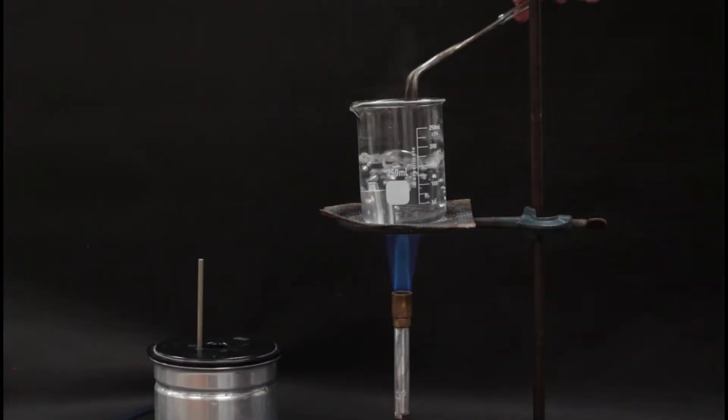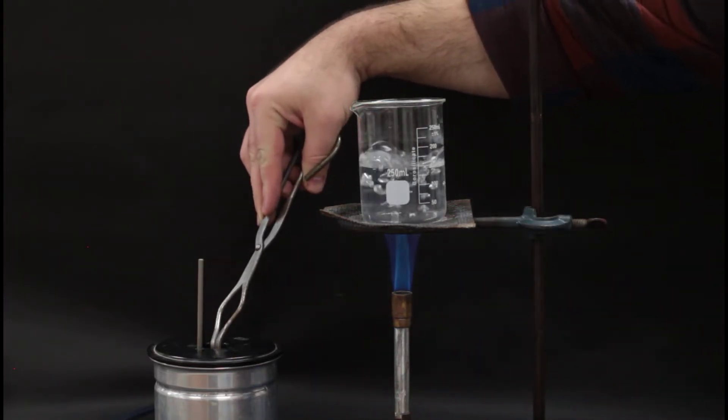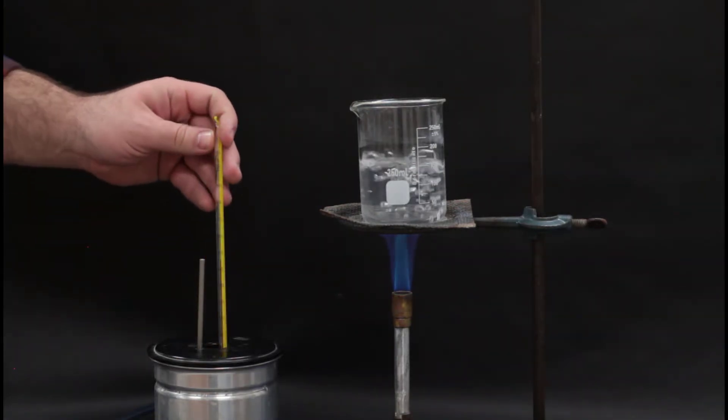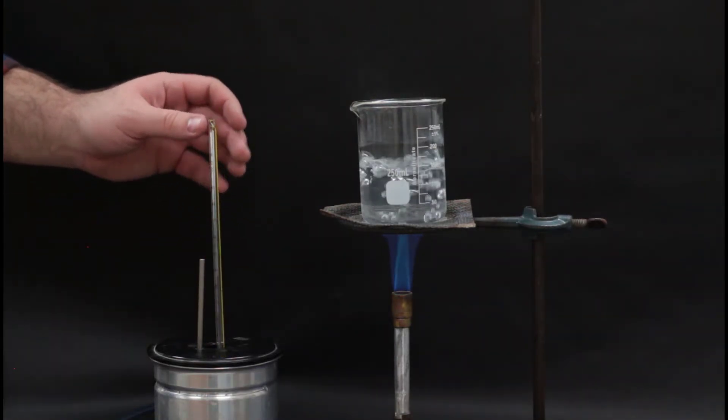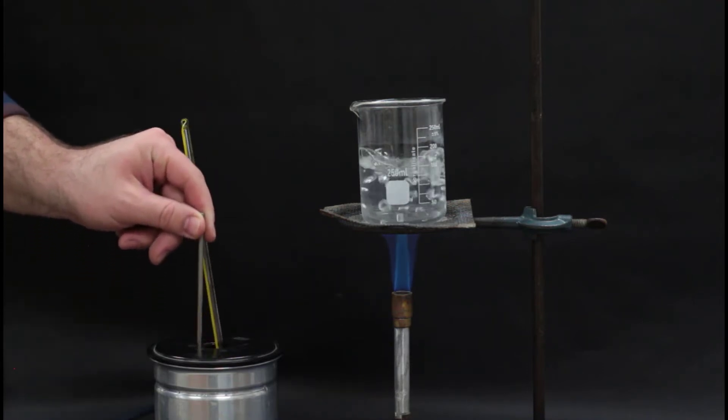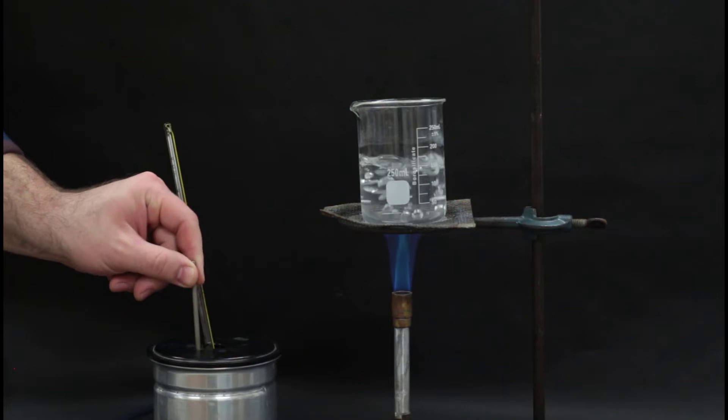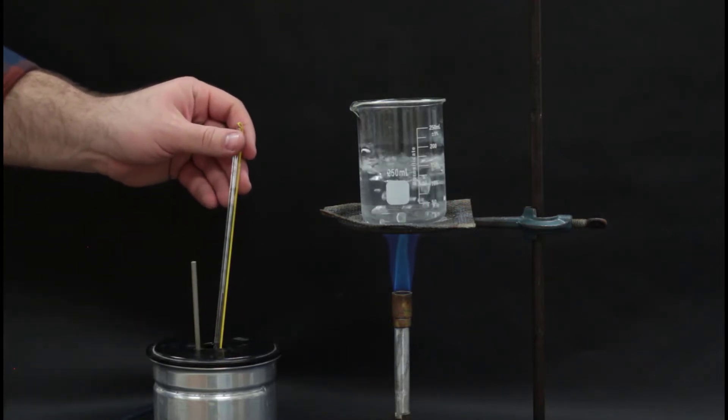Next, use the tongs to carefully move the metal from the boiling water to the calorimeter. You'll want to do this quickly so that the metal doesn't lose too much energy to the air. Mix the water around a little bit and record the peak temperature of the water. Record this as the final temperature of the metal and the water.